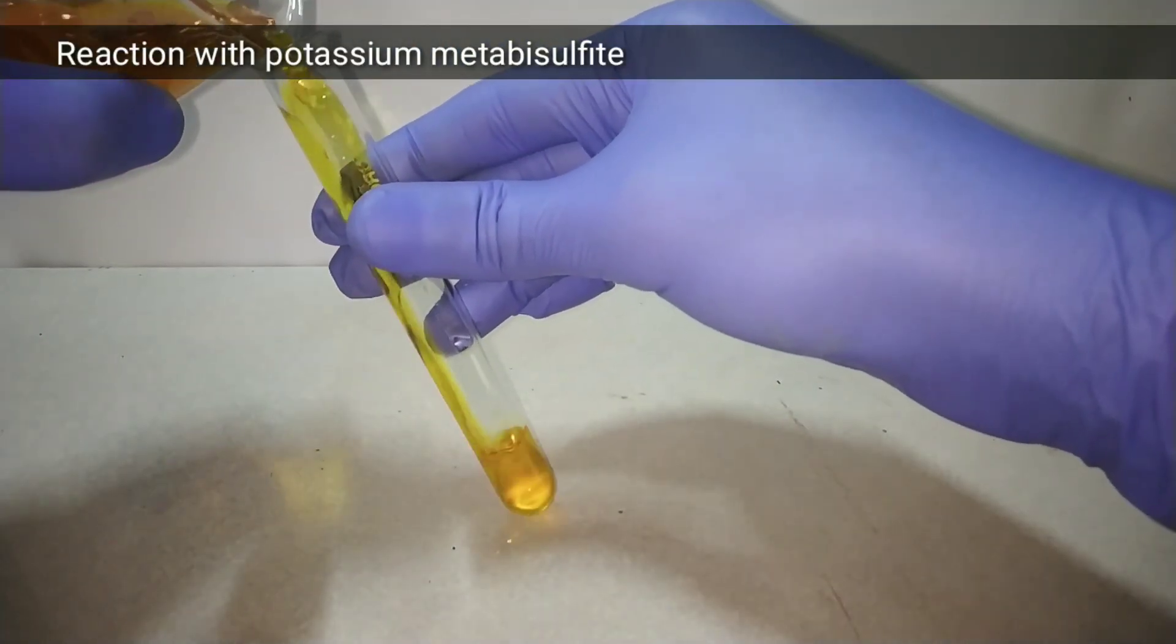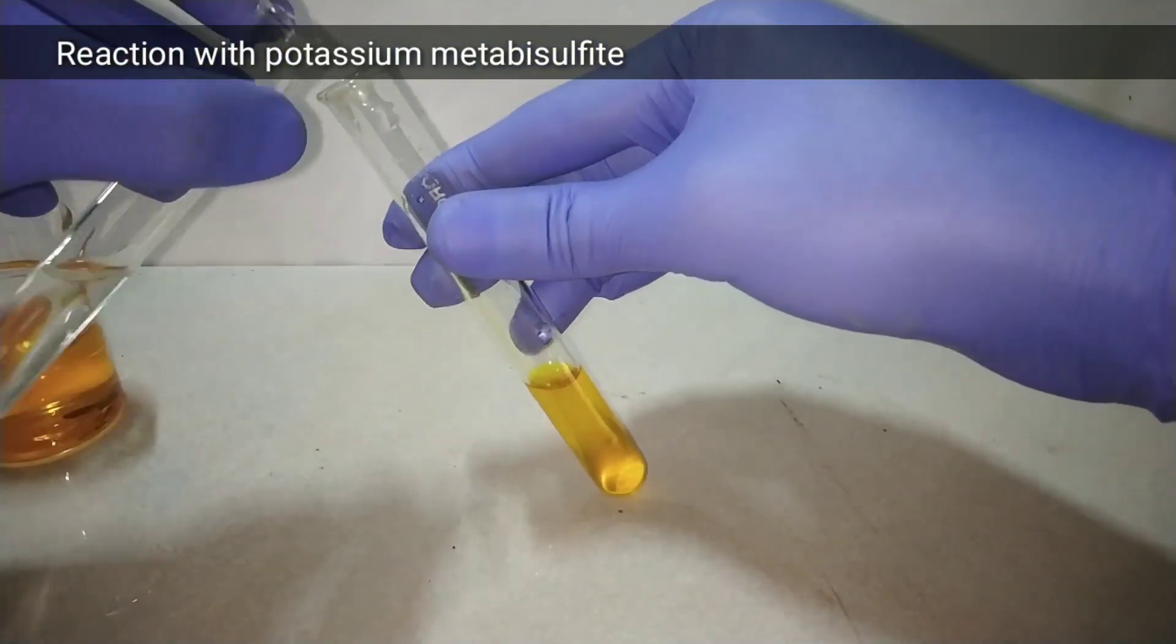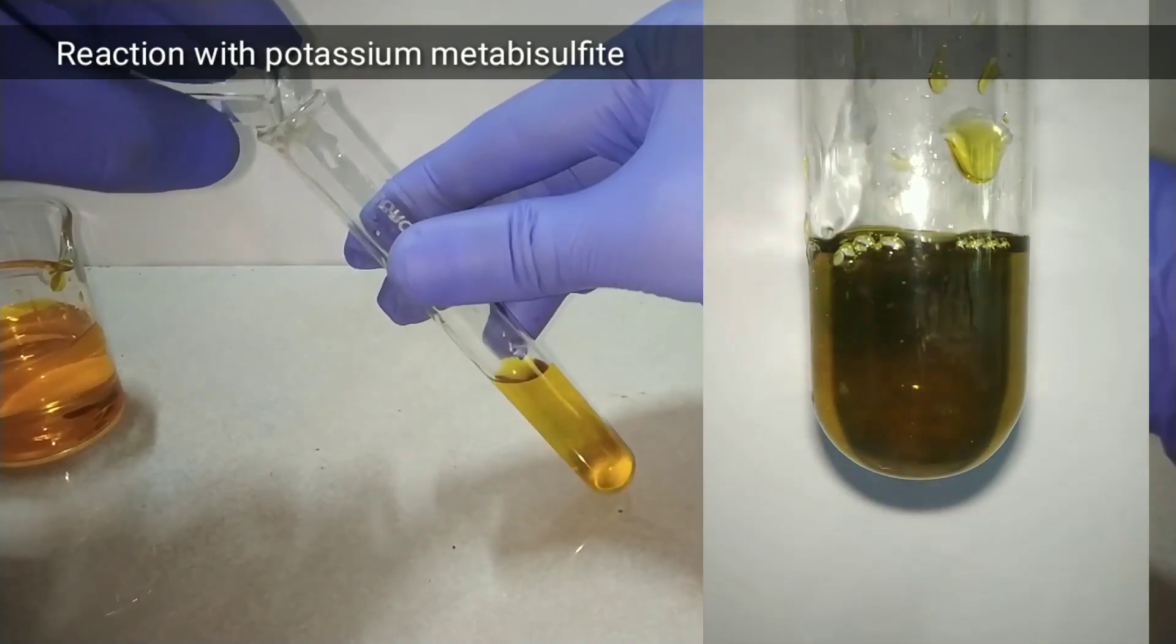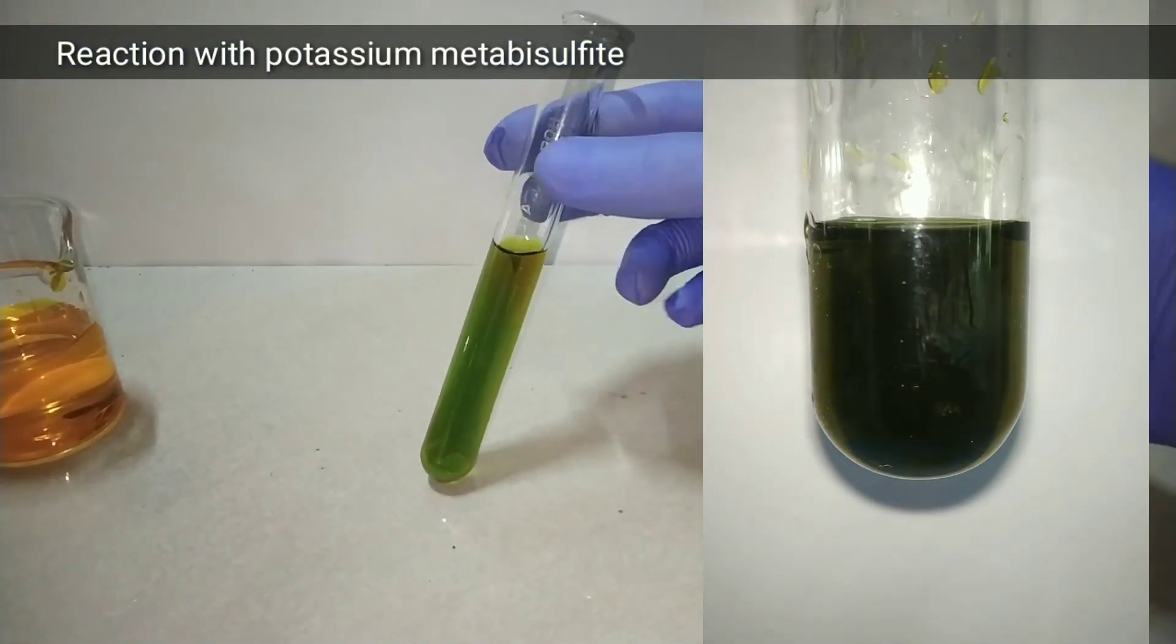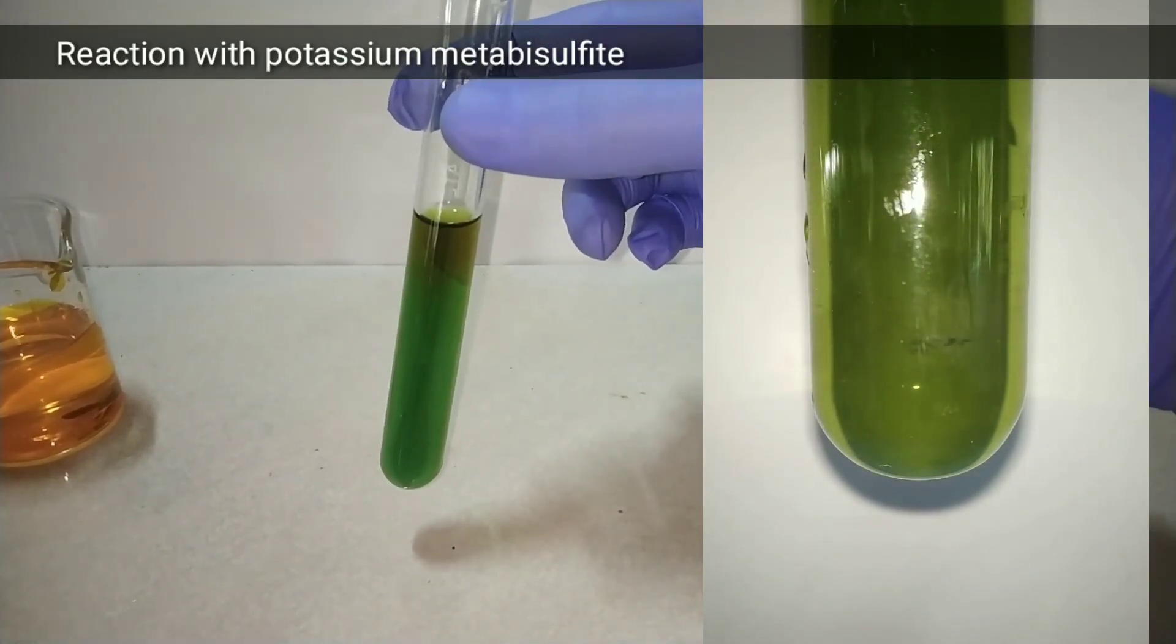On adding potassium metabisulfite which is a reducing agent, the plus 6 oxidation state of ammonium dichromate has been transformed to or reduced into plus 3 oxidation state and you can see the color has turned from orange to green.